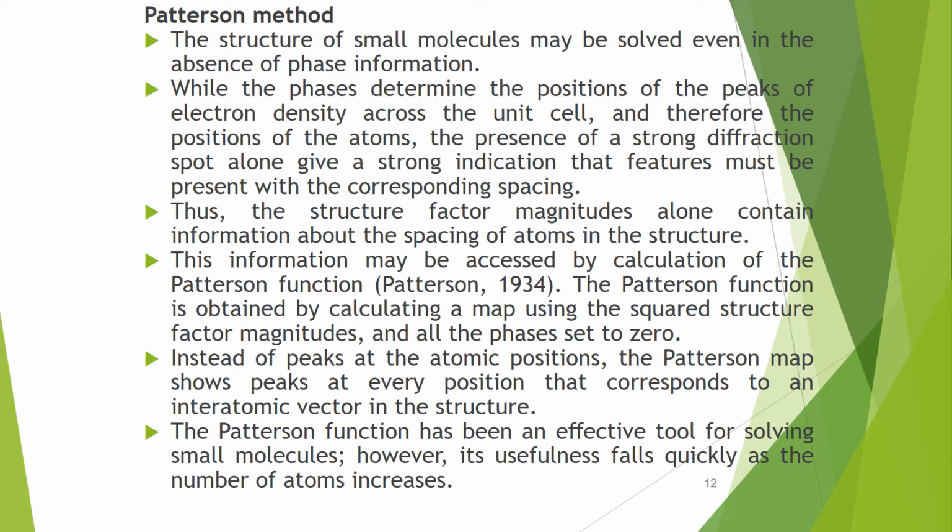While the phase determines the position of the peaks of electron density across the unit cell, and therefore the position of the atoms, the presence of strong diffraction spots along a direction alone gives a strong indication that features must be present with the corresponding spacing.